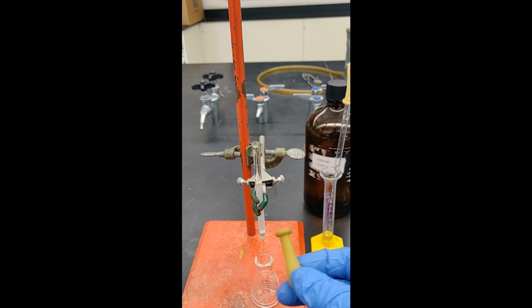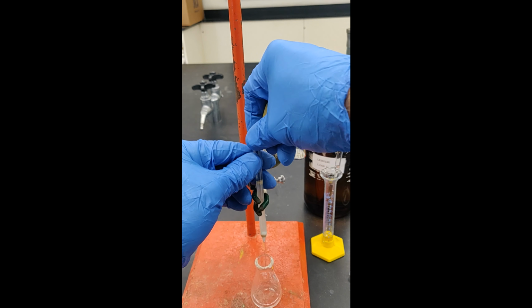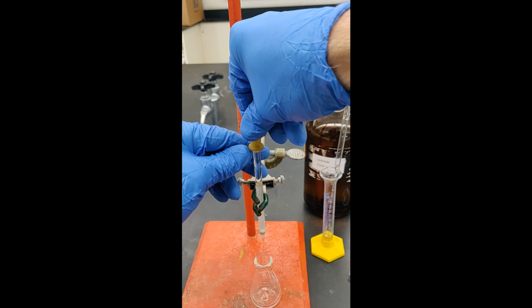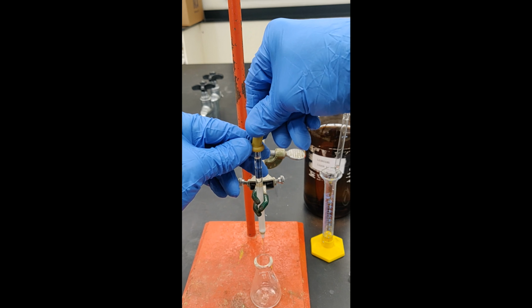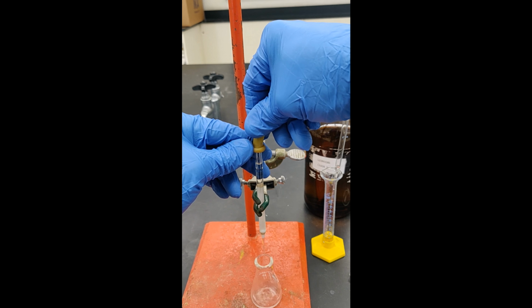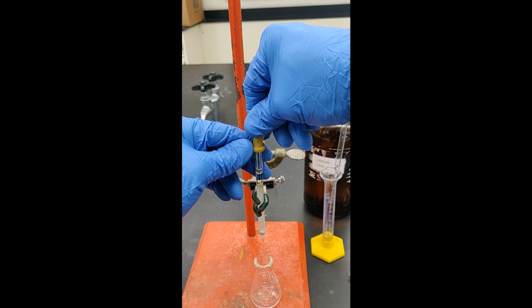Remember that a rubber bulb works just as well as the syringe device to force Ligroin through the column. But remember not to push the glass of the pipette column too far into the rubber bulb so that you can quickly remove it to release the pressure just as the descending liquid approaches the sand.